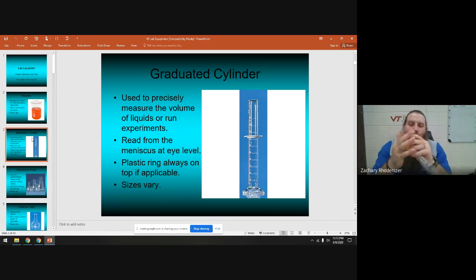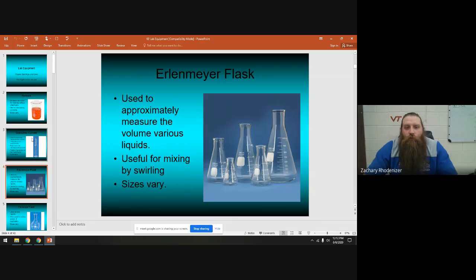Make sure the collar is up near the top, seated correctly — not crooked and not barely sitting in there. Give it a little tap and you'll hear it seat. Always read from the meniscus, which is the middle part. For water the meniscus is at the bottom; for something like mercury it piles up at the top. Read right in the middle and you'll get a good reading.